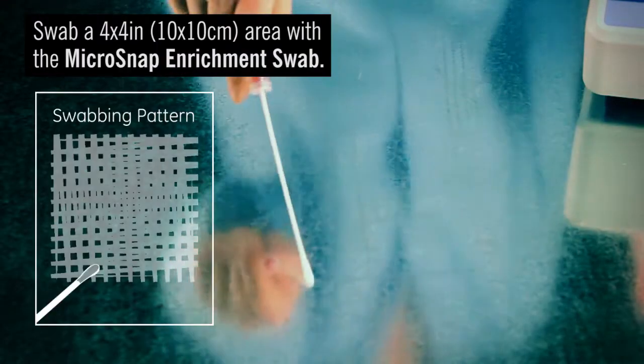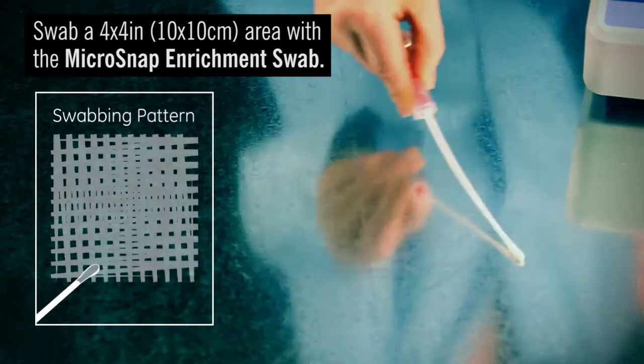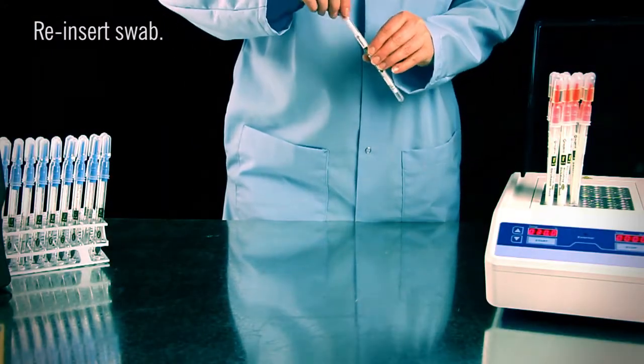Swab a 4 by 4 inch square area, applying sufficient pressure to create flex in the swab shaft and rotating to collect sample on all sides of the swab tip. Replace the swab in the tube.